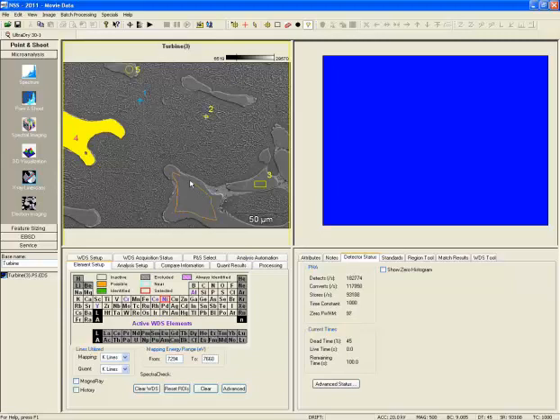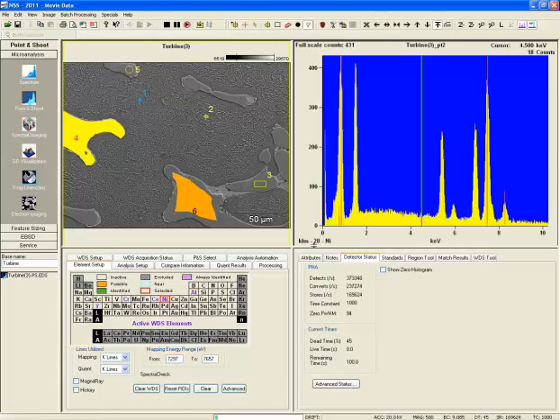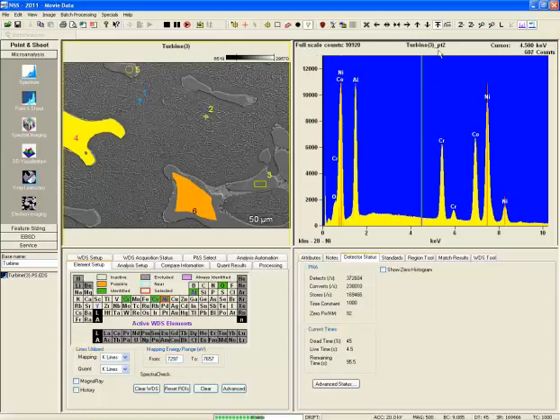Now the software will cycle through all of these acquisitions one at a time and acquire each of those. So once again, let's go to the addition of both detectors, hit the go button, and now it will acquire each data area in turn to collect the spectrum and perform the peak ID and the quant. We can watch that by looking at the upper right-hand quadrant, the label on the point.